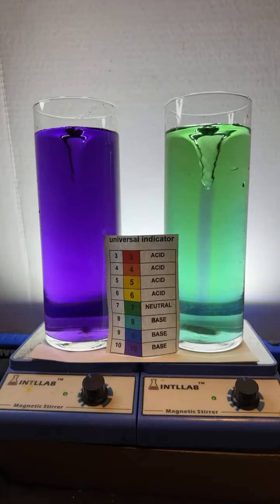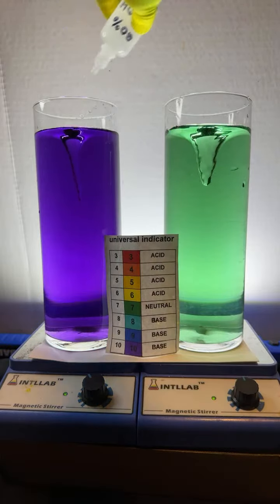So Perla asks, how did that blue turn to red? What happens if you put a Tums in it, asked Chad. What a great question. I don't have Tums, but I have some milk of magnesia we could try. I do have some of that.